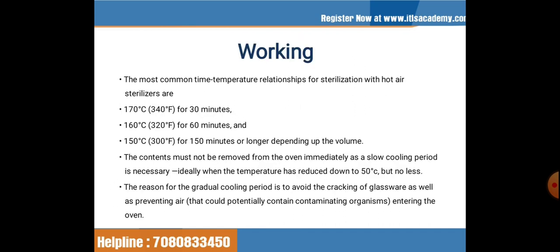Let me tell you the uses of a generally hot air oven. A dry heat cabinet is easy to install and has relatively low operating cost. It penetrates material, it is non-toxic, does not harm the environment, and it is non-corrosive for metal sharp instrument.